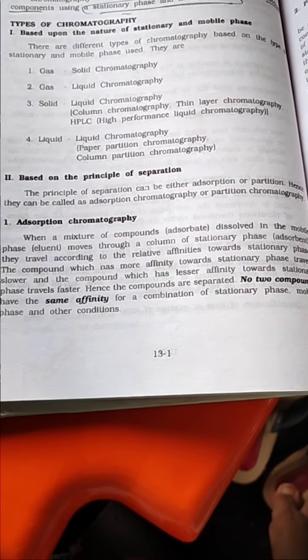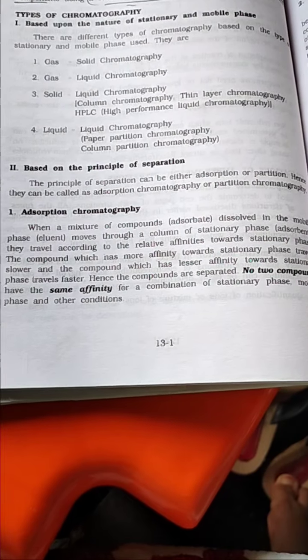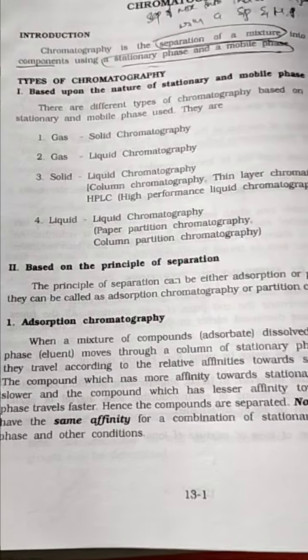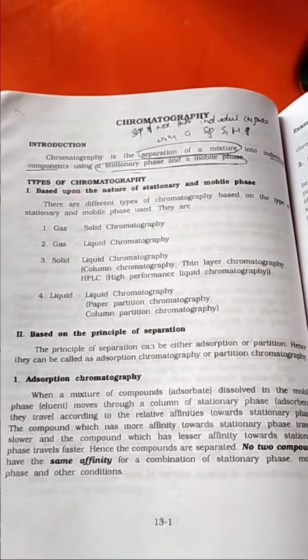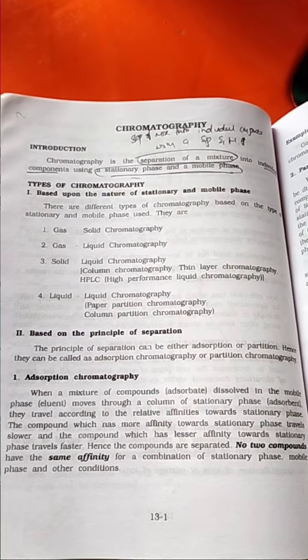They travel according to their affinity toward the stationary phase. The molecules which have high affinity pass more slowly than the molecules having low affinity, and the compounds are separated.